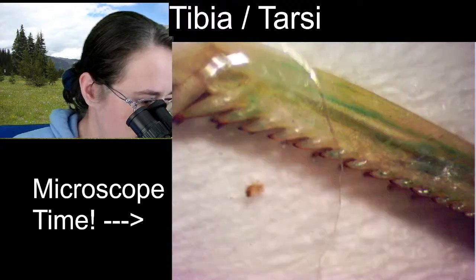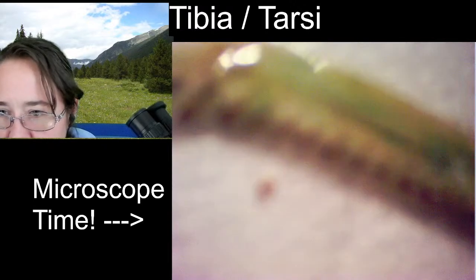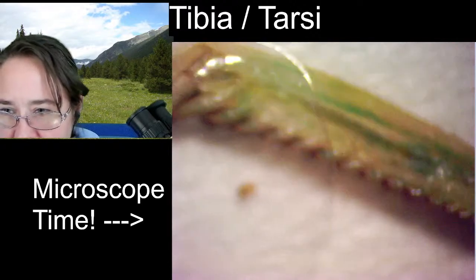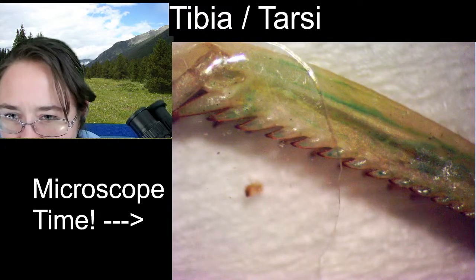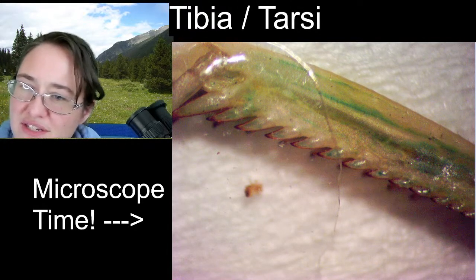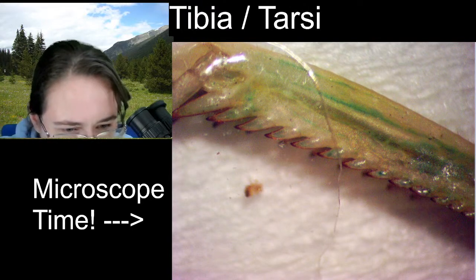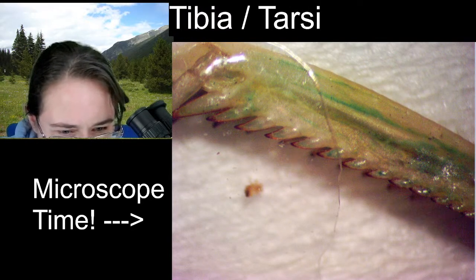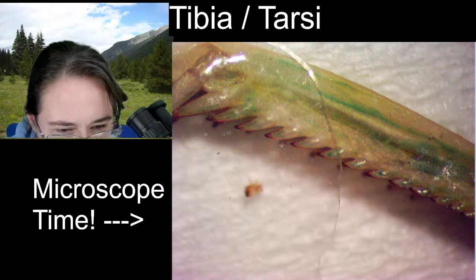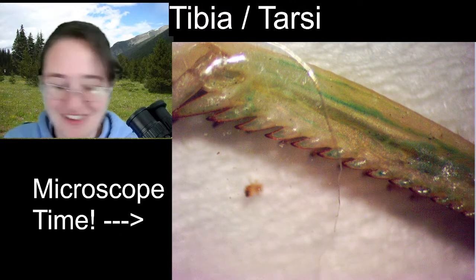And on the tibia, you also have a double row of spines on the inside of the tibia. They're just a little bit trickier to see because the tibia is a little thinner. And in math, an annulus is the region between two concentric circles. Cool!